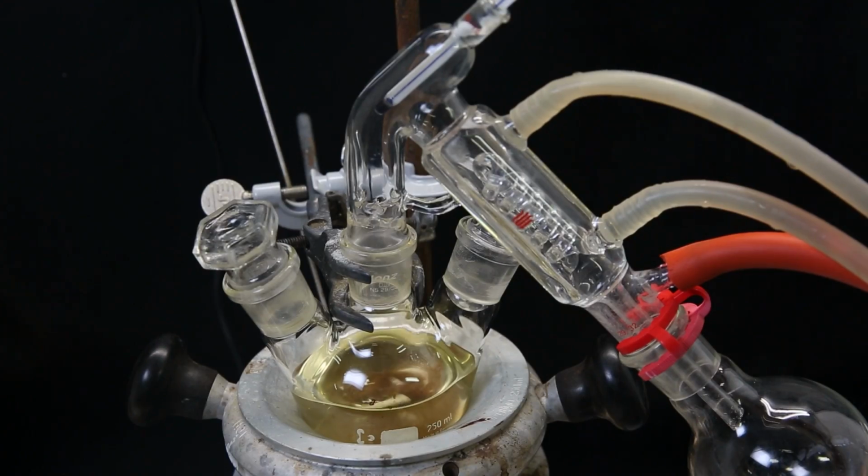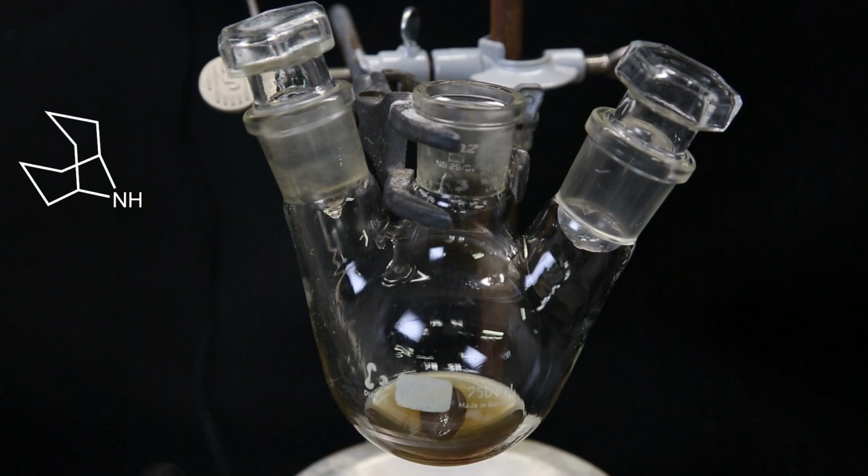I then set the filtrate up for short path vacuum distillation to remove most of the isopropyl alcohol. Afterward, I am left with a concentrated solution of the product, which also contains some toluene.